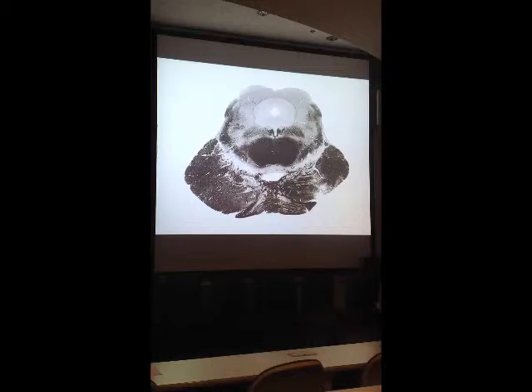Now on this slide, one of the distinctive features compared to the previous slide of the midbrain, again, this is slide 23, is the decussation of the superior cerebellar peduncle. And the level of the midbrain where these peduncle fibers decussate is usually the level of the inferior colliculi. I know that this is contrary to what he labels these colliculi in the atlas, but it's the bottom edge of the superior colliculi. But I always think of them as inferior colliculi because they go along with these decussations.